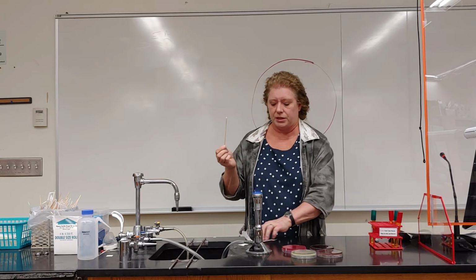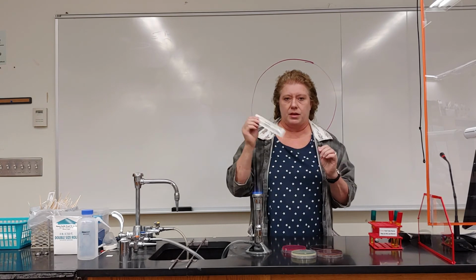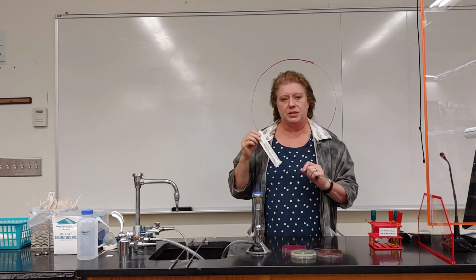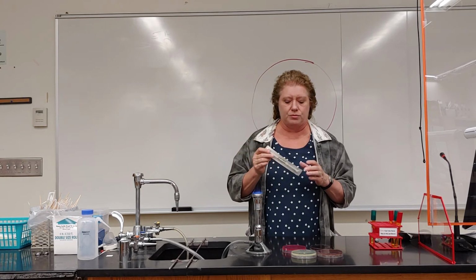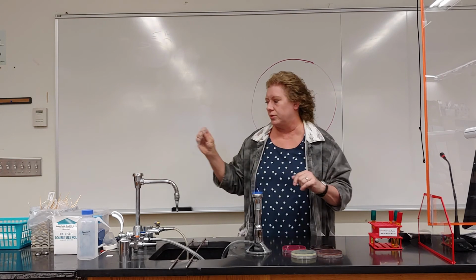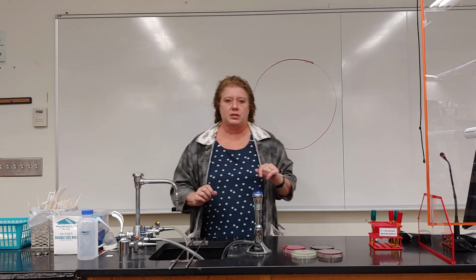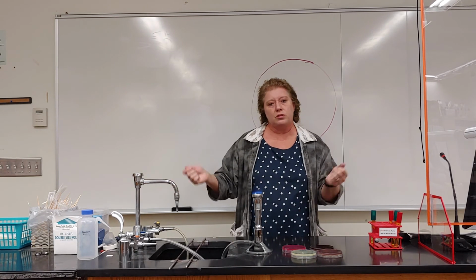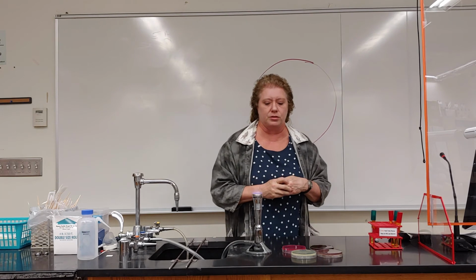You're finished with all your plates. So what you do is gently stick this back in your wrapper. And then you dispose of it in a container that's going to be autoclaved, okay, because you want to kill the bacteria in here. So you never put this in your regular trash. Okay, so this is a little disposal bin that has contaminated items in it that I will, now that it's full, take and put in the autoclave, kill everything before it goes into the regular trash.